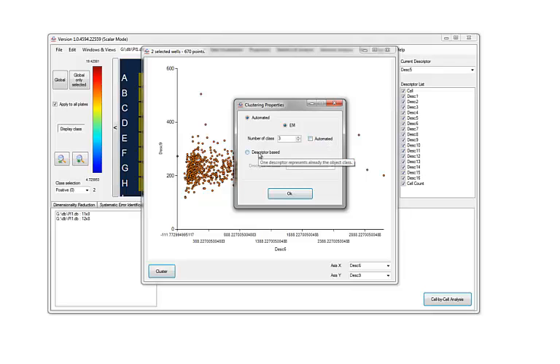There's another option that is descriptor based. It just means that the user can have defined by himself also in the original file a class for each cell of interest. Let's say, for example, user supervised selection. And then you can use the column, the descriptor that is related to the class to perform the learning step. In this case there is nothing like that, so we'll just keep it this way with automated EM 3 classes.